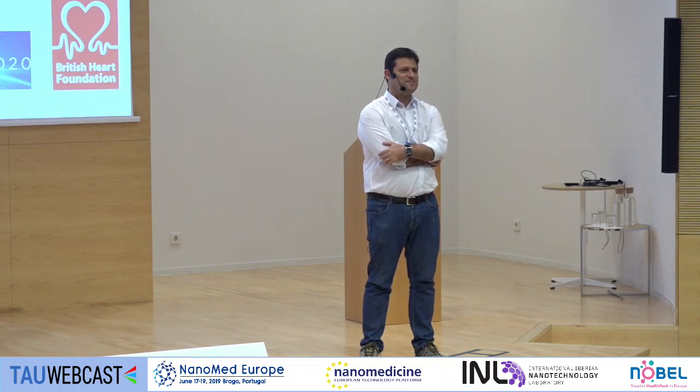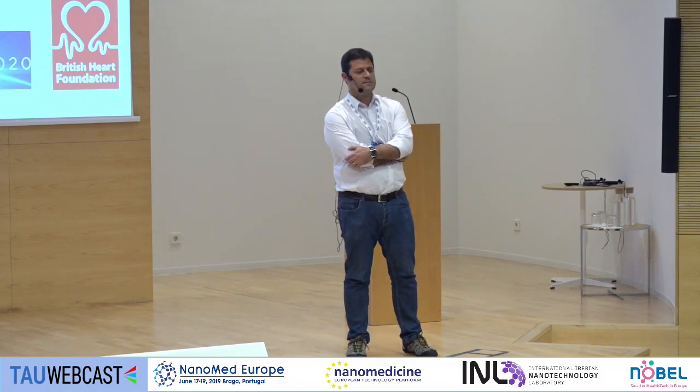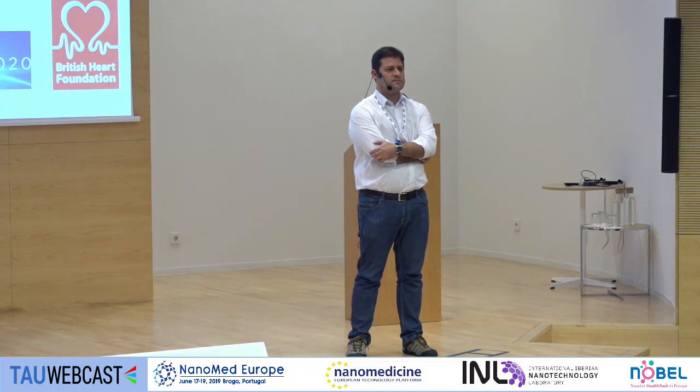Hi, Nuno. Impressive work. Thank you. I have two questions. First is, are all of these analyses made in live cells? And second question is, if they are live cells, how can you do the AFM acquisition? Because I know it takes time to do an image and to do all the characterization. How can you do it with a cell that needs to be in suspension and is not adherent?